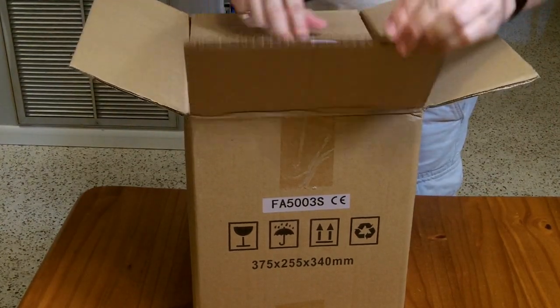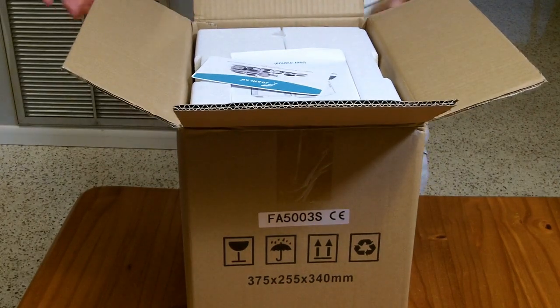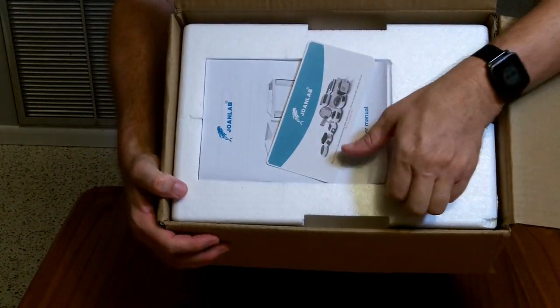I was sent this to review for free. If you wanted to purchase it, it would cost you about $280. Alright, so it's packaged in styrofoam.